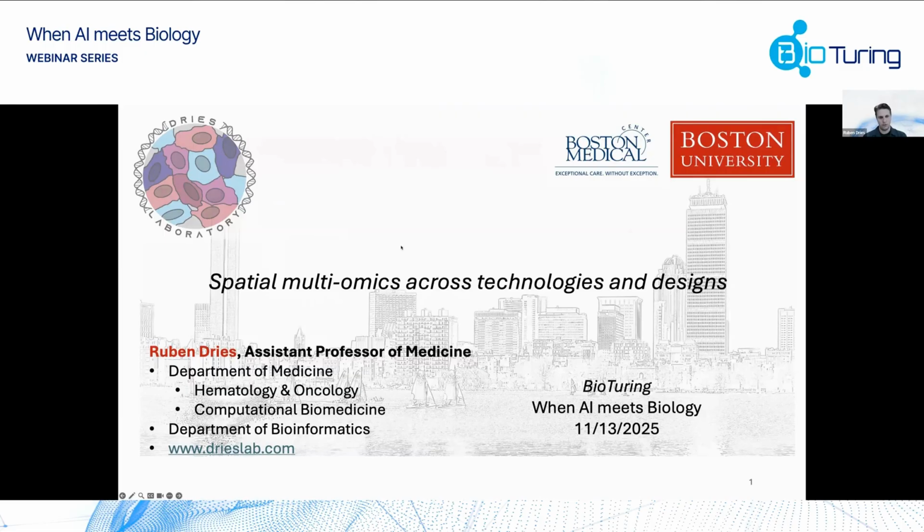The title of today's talk is Spatial Multiomics Across Technologies and Designs. It will focus a lot on our software, but I want to show that, as was already said in the introduction, the spatial field is very complex and diverse, with lots of different technologies and lots of different ways to analyze data. So we need a very flexible platform.